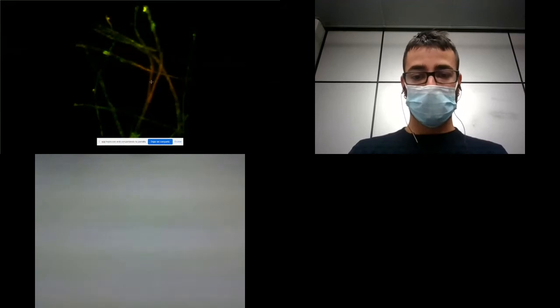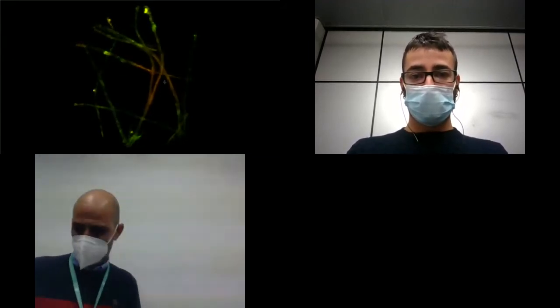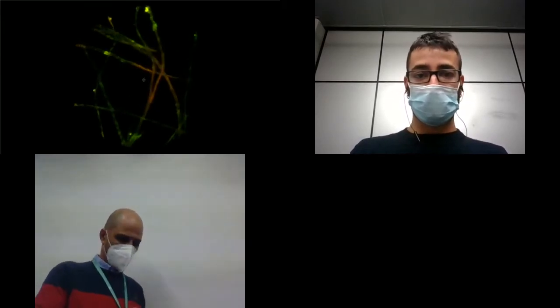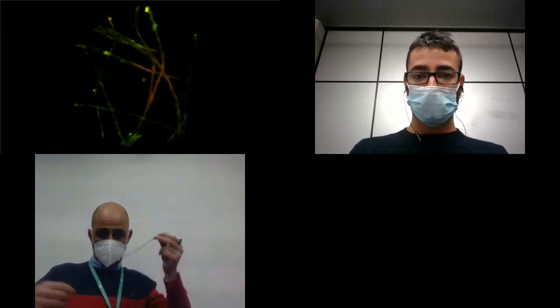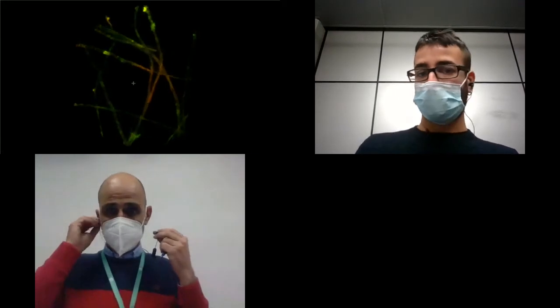Here you can see the different perspectives of the sample. You can see what's behind and what's in front, and resolve the occlusions. For this sample, we are using a 20x objective. You can see there is parallax between the views.